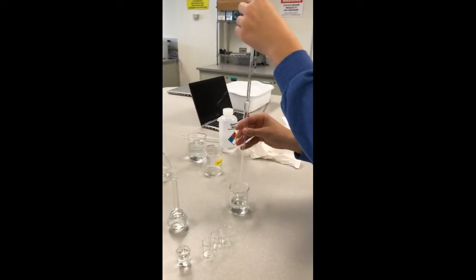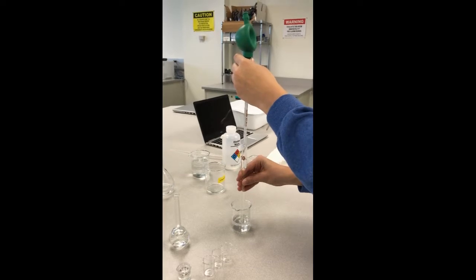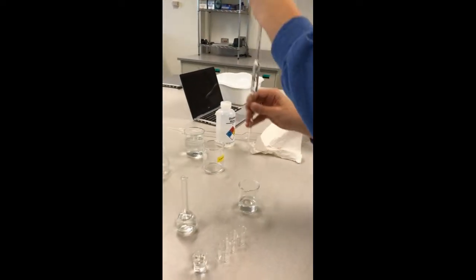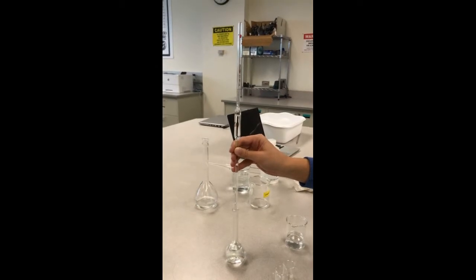We're going to now take 10 milliliters of DI water and put it into our volumetric flask that we are making the serial dilution in. And when you're done, again, you expel the water into the volumetric flask.